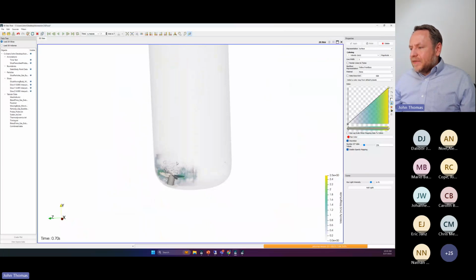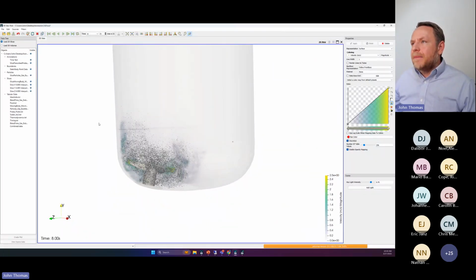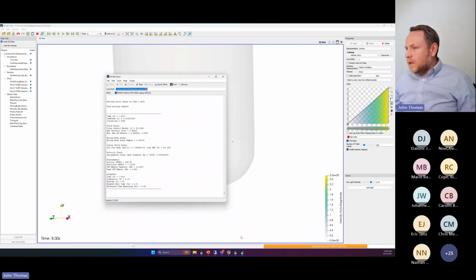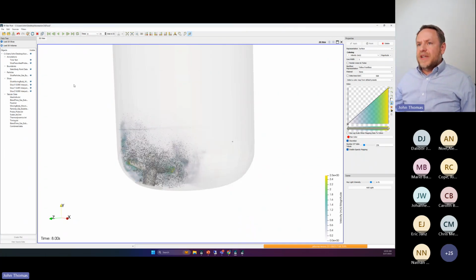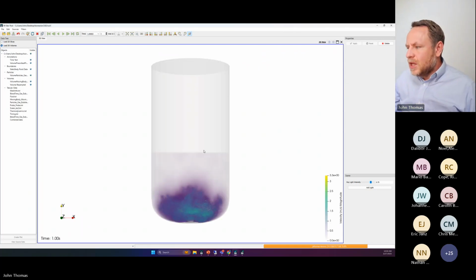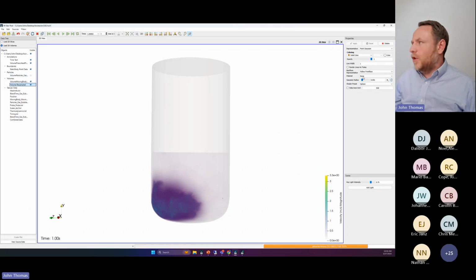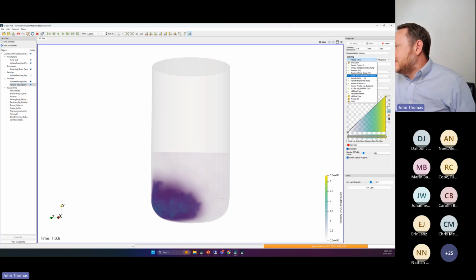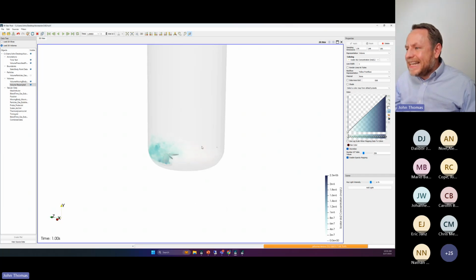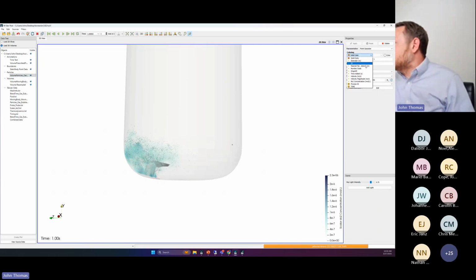And instead of visualizing velocity or scalar fields at this point, I'm going to go ahead and look at my DO, because I've got DO coming into the system via the bubbles. So we're going to snap over to this 3D volume here and look at this guy. So there's velocity hanging out doing its thing. There are my bubbles. I'm going to turn the bubbles off temporarily and go to my volume and look at my DO concentration. And look, I can see DO in the aqueous phase now. How did it get there? The bubbles. If I look at the bubbles, let me colorize them by their DO concentration.